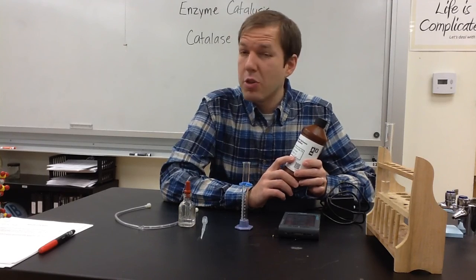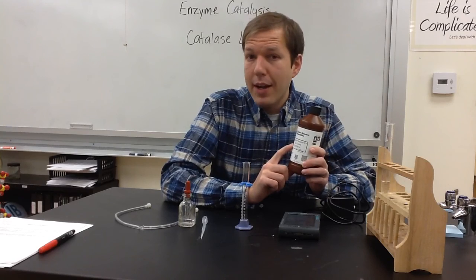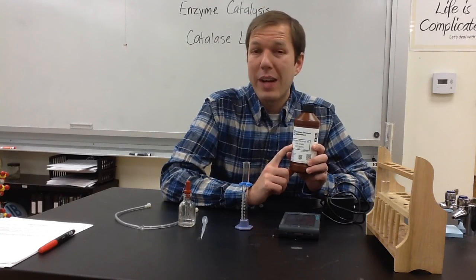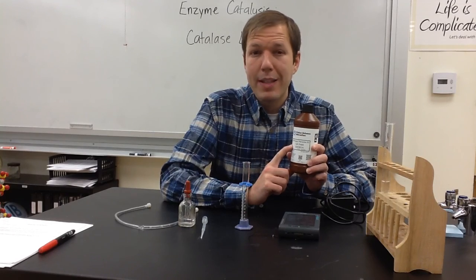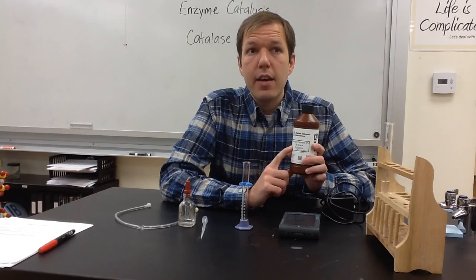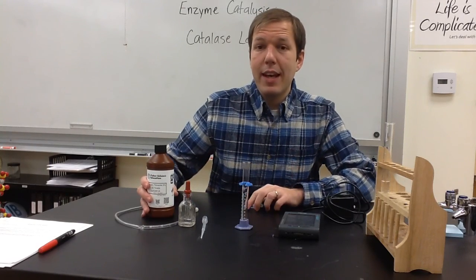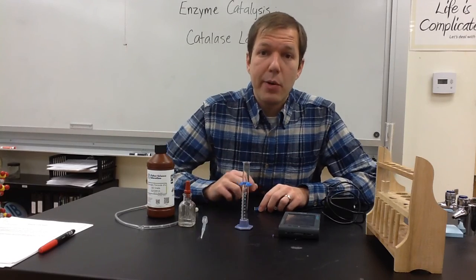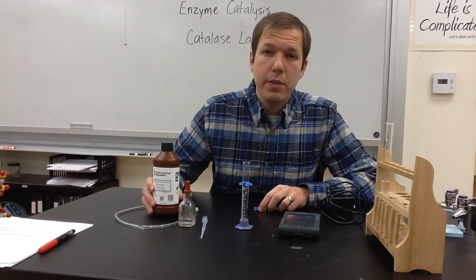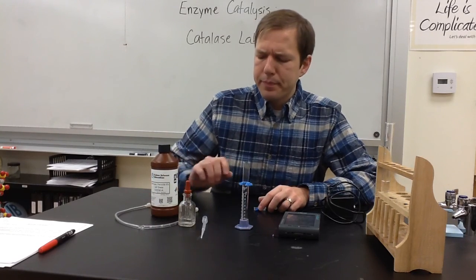Hydrogen peroxide is a strong oxidizer, which means it's very reactive. So the hydrogen peroxide, as it moves around, might bond with and react with other proteins or possibly DNA in the cell, and as a result, the cell could die. In this lab, we're going to be using the breakdown of hydrogen peroxide by catalase as a way to measure several different variables about the rate at which enzymes work.